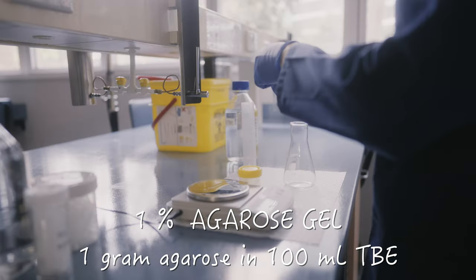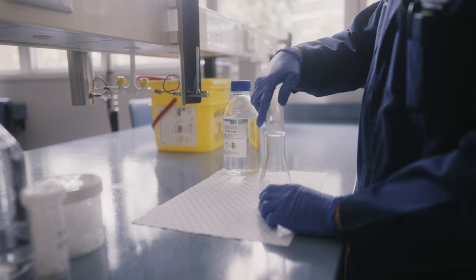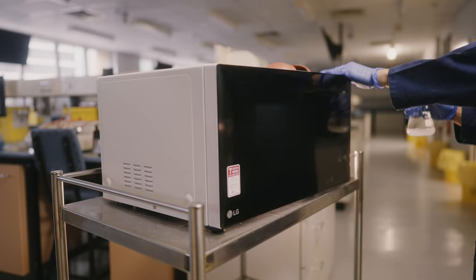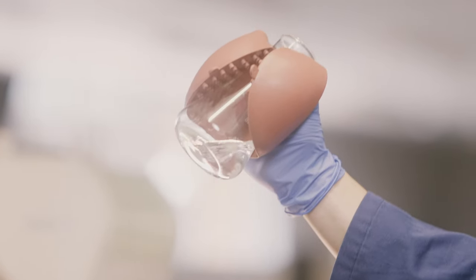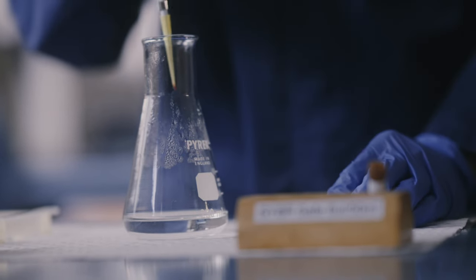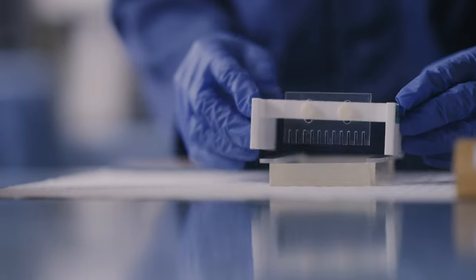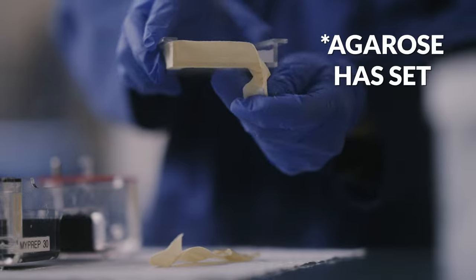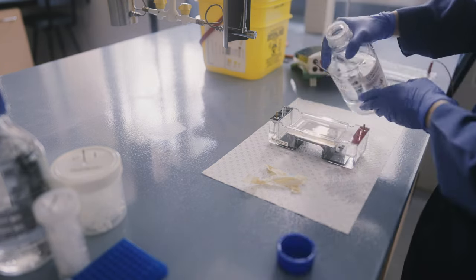A 1% agarose gel — 1g in 100ml of Tris-borate EDTA or TBE buffer — is what we're setting up, but you can increase or decrease the agarose concentration depending on the size of the DNA bands you're looking for. Smaller band sizes will need a higher percentage agarose gel, although we typically don't go above 2% agarose. You need to repeatedly microwave the solution to melt the agarose, about 10 to 20 seconds each time, mixing well to check that all the agarose has melted. The solution should be clear and free of any lumps. Now we can add CyberSafe, a stain that will detect DNA in the gel and glow when exposed to UV light. We pour the solution onto a gel tray sealed on each end with masking tape, then put a comb in the gel tray to create holes so we can load DNA into different lanes. Once the agarose has set — about 30 minutes at room temperature — you can peel off the tape, load the gel into the electrophoresis tank, and fill the tank up with the same TBE buffer used to make the gel.